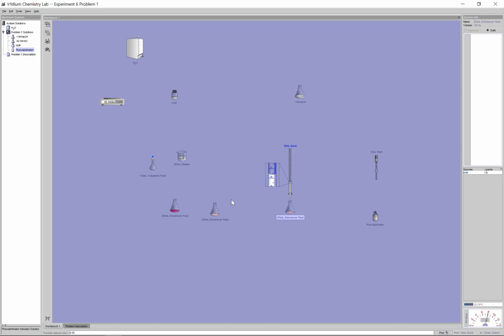So hopefully using these aliquots here, one of them was definitely overshot. Just to give me an approximate of what the concentration is, hopefully between these two here, I have a fairly good feel of what the NaOH is. Now, the concentration of NaOH here is identical to the concentration of the 1 molar NaOH. Like I mentioned here, unfortunately, for part 2, the NaOH here is about 10 times more concentrated than the acid.